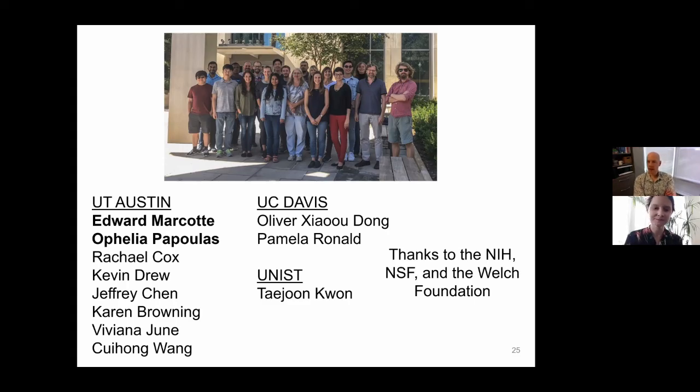Another question is, there are many cross-linkers. Did you use them and how did you decide which one to use? We used the DSSO MS-cleavable crosslinker. The big thing was that the signal was really soaked up by the highly abundant complexes. So we're really seeing things like CCT and photosystem 2, but the coverage of lower abundance things was just not there for us.